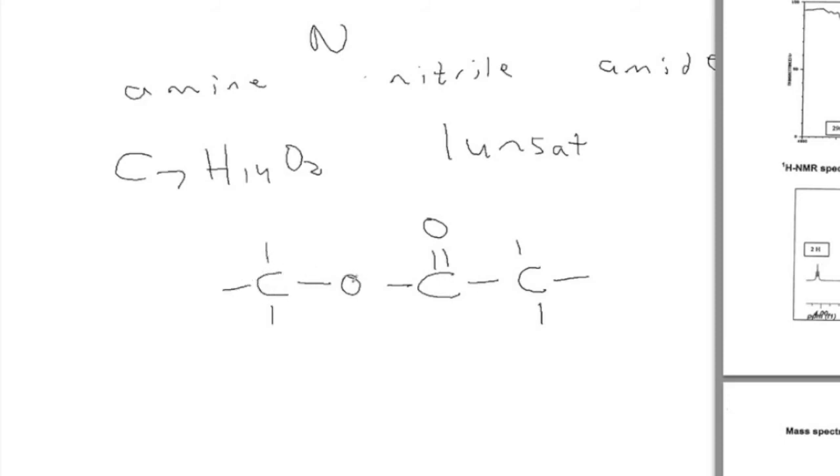It can't be a hydrogen, because then this would be a carboxylic acid. And we know it's not a carboxylic acid because there's no proton absorption in the 10 to 12 region. So I just want to point out you can write all of this down just by knowing it's an ester. Okay, so this would be a good place to start.